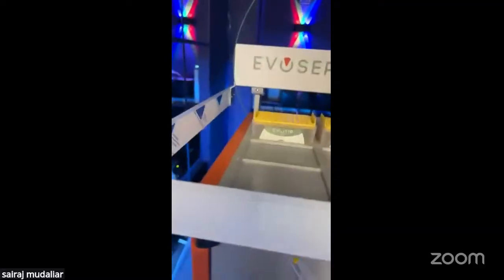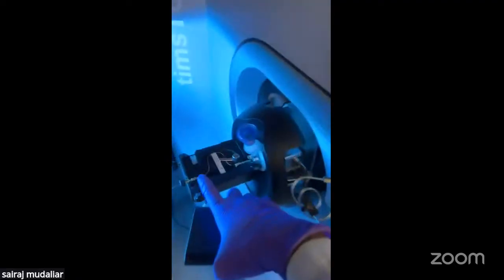Here, these are the Evotips where we load our samples. When we start the run, this robotic arm picks up the Evotip and injects the samples here. From this, the peptides come through this transfer line and reach the C18 column. In the C18 column, peptides are separated based on their hydrophobicity. After separation based on hydrophobicity, the peptides go inside the ionization source where ionization will happen.